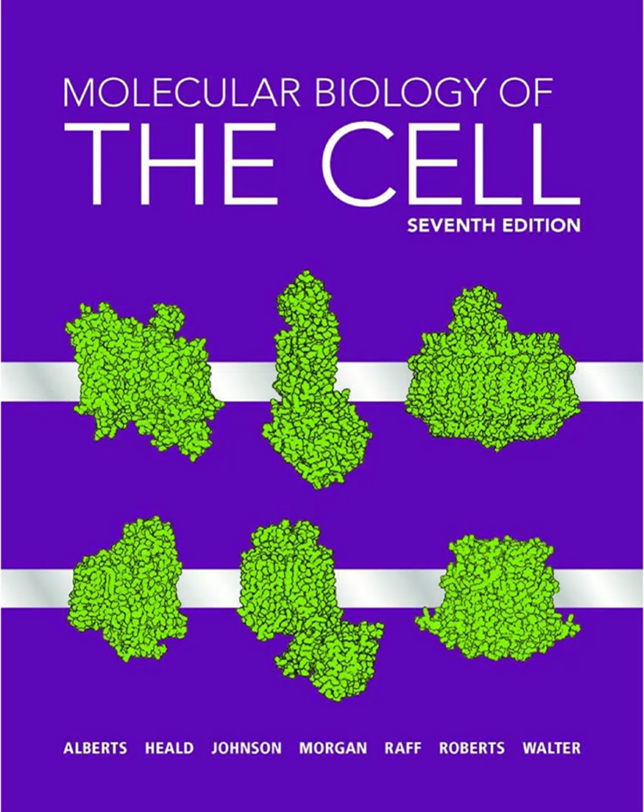Very clever. And you stack these sections for a 3D view. Yes, you can collect a stack of confocal sections to create a beautiful, high-resolution 3D image of complex structures, like neural networks or the elaborate internal structure of organelles. So confocal versus deconvolution. When would you use which?